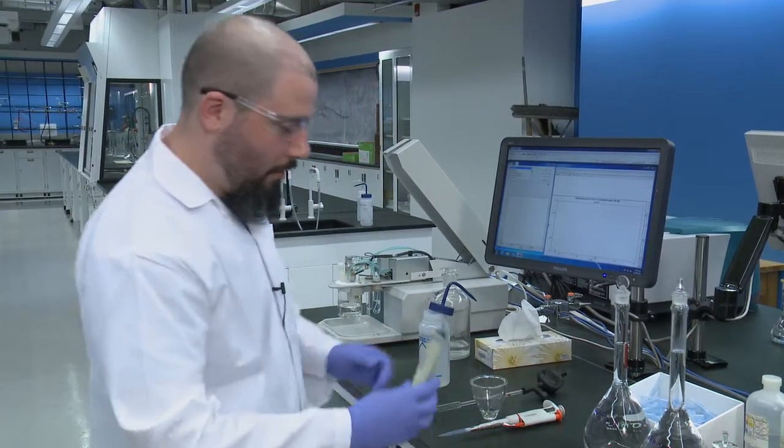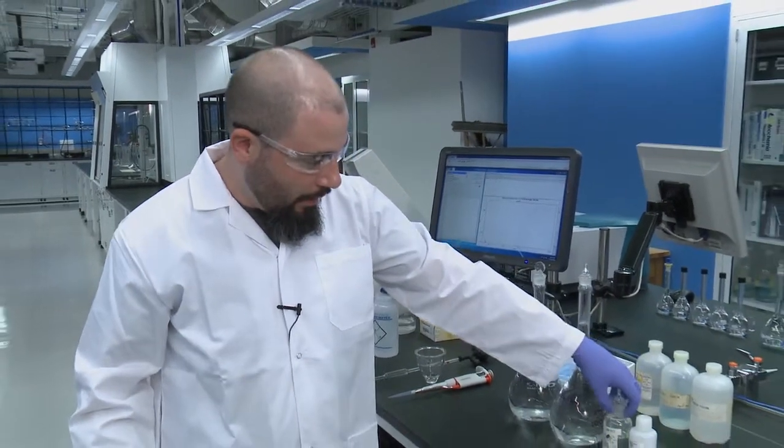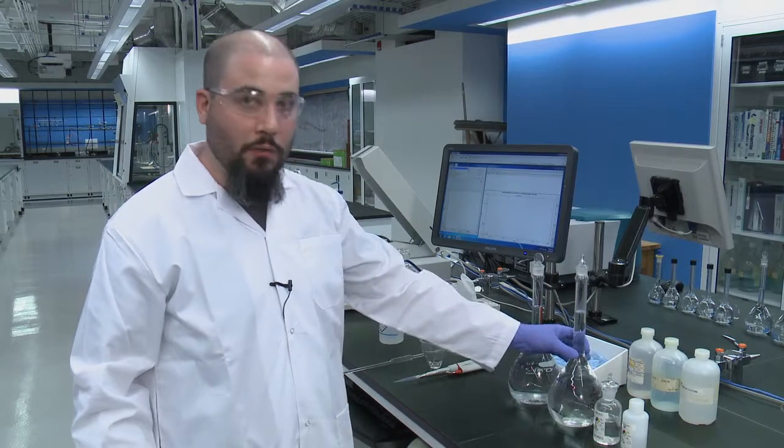Then using your automatic pipettes, you'll want to add your 1 molar acetate buffer, 3 molar potassium chloride, and your unknown to the cell.